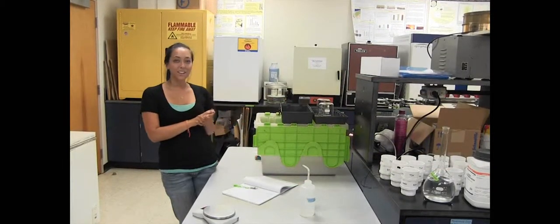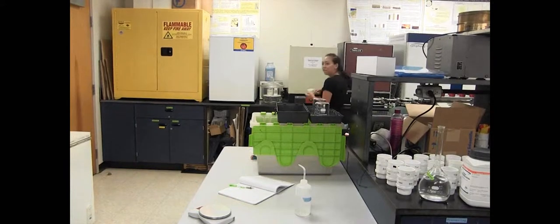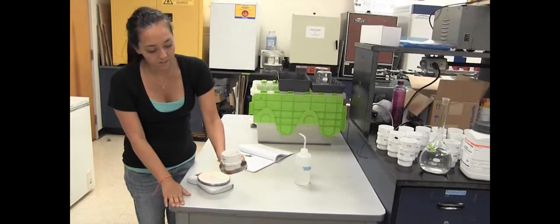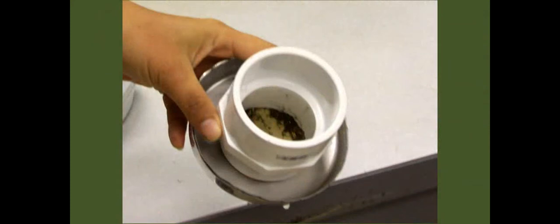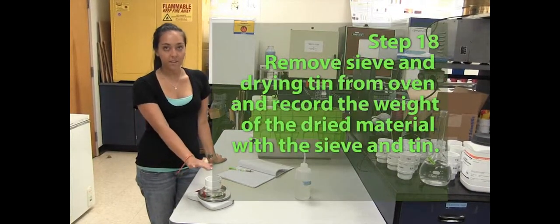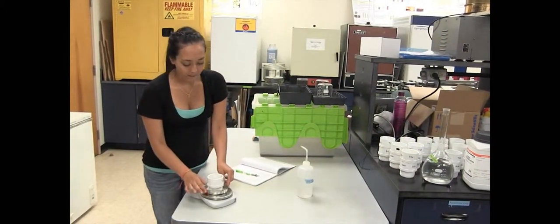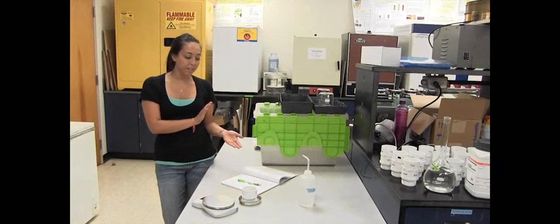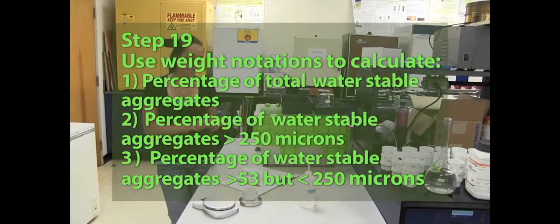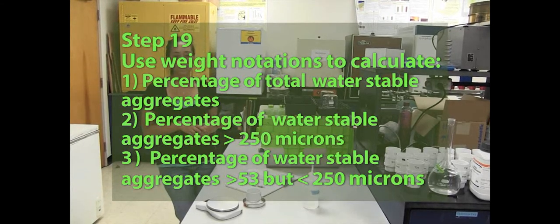Now that we have had our sieves drying in the oven with our primary particles, you can go ahead and take those out. This is about what it looks like when it's dry — you can see it's all large particles and organic matter. Then again using our field scale, we're going to weigh the tin, the sieve, and the dry primary particles, and record that weight in our notebook. Then it's just a matter of doing some simple calculations in order to get your percentage of total water stable aggregates, percentage of water stable aggregates greater than 250 micrometers, and percentage of water stable aggregates between 53 and 250 micrometers.